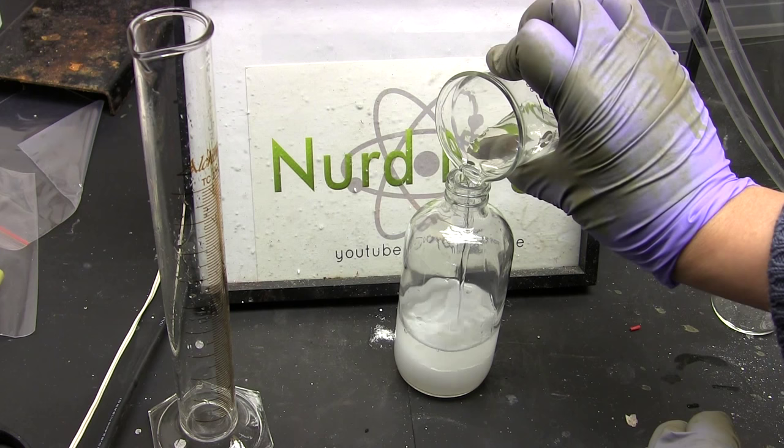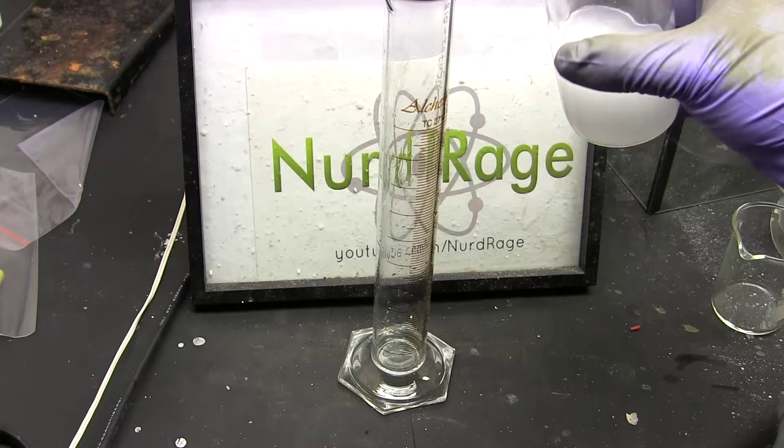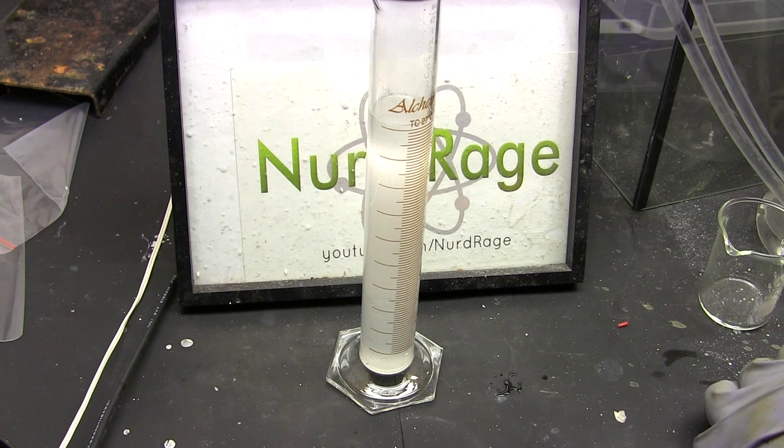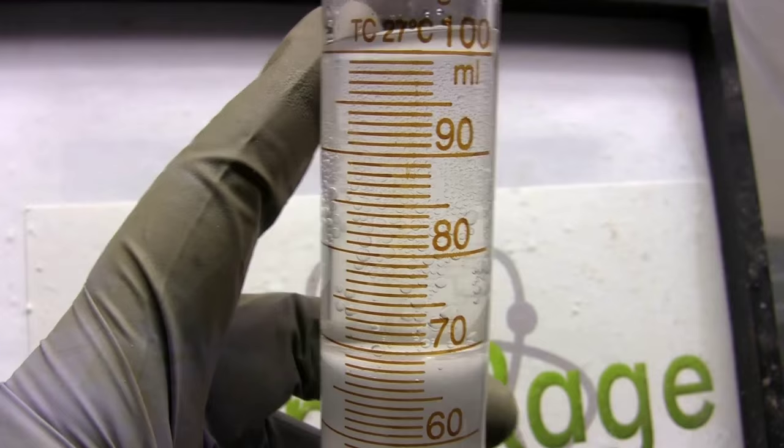Here I'm mixing 50mL of the lacquer thinner with 50mL of water. Methanol, methyl ethyl ketone and acetone if it is present are all very soluble in water but toluene is almost insoluble. Therefore by mixing the lacquer thinner with water I should see a floating layer of nonpolar solvent consisting mostly of toluene and some of the other components partitioned into it.